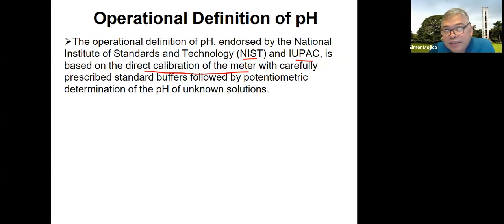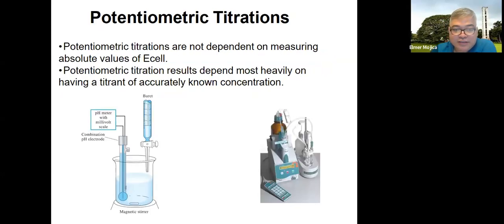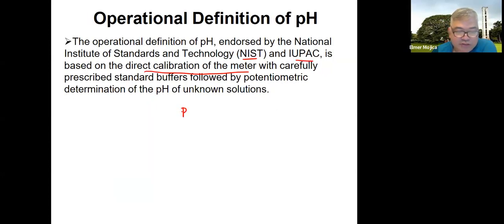That's why it's a must, whenever you measure pH, that it should be calibrated. So it could be like pHs = (Es - K) / 0.0592, where Es is the cell potential when the electrodes are immersed in the buffer standards.